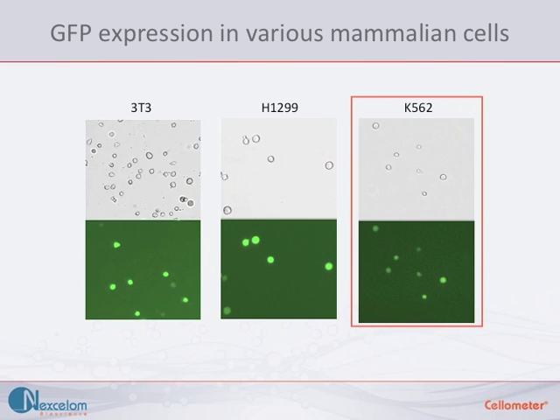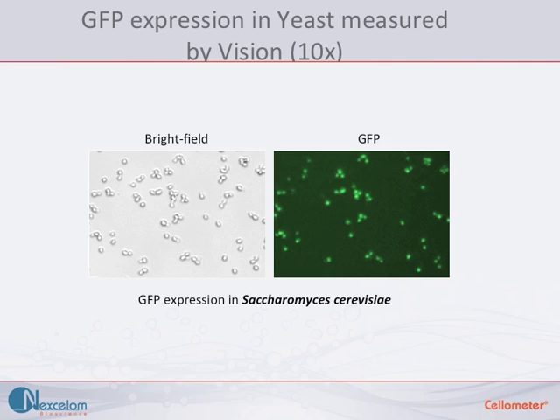Detection of GFP expression can also be performed in yeast. These micrographs show GFP expression in Saccharomyces cerevisiae. Since the imaging of yeast requires a higher magnification, these particular brightfield and fluorescent images were captured by a Vision 10x instrument.